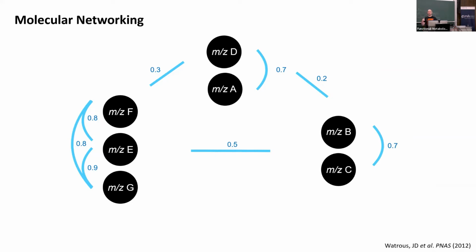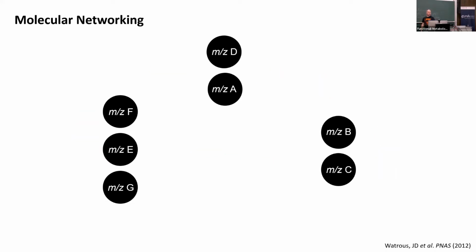Now, I don't know, what level of annotation would that be? Probably, yeah, exactly, 3. A little bit lower, but this is really useful to systematically mine your data and bring things to your attention which you would not be able to capture yourself, because with DDA and these fast scanning instruments, we get thousands of MSMS per run. So you can simply not go through them anymore.